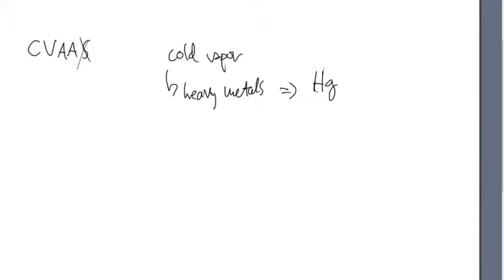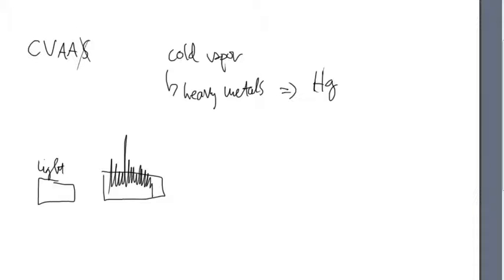All right, so how is this thing set up? Well, you still need a light source, and that light source would be a mercury. The sample chamber normally here is a burner with a flame, so we'll talk about this in just a second. And then over on this side, we have a detector that sees everything that comes in and out of the machine. We also have a sample tube, and this sample tube is through a capillary. We didn't draw this in the graphite furnace because, quite honestly, there was nothing special about it. But this is really where the cold vapor attachment comes in. So this nebulizer tube or nebulizer capillary is what sucked my sample up into the flame for it to be presented and for it to be analyzed.